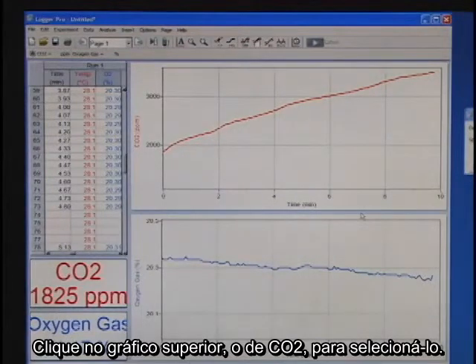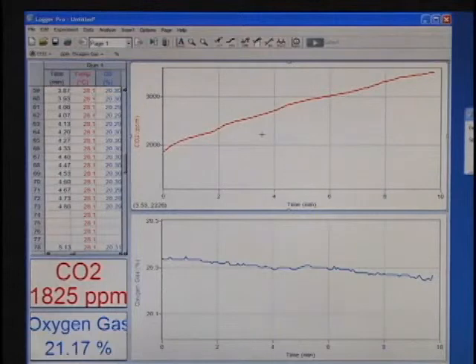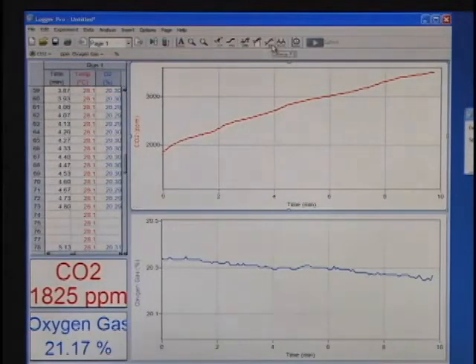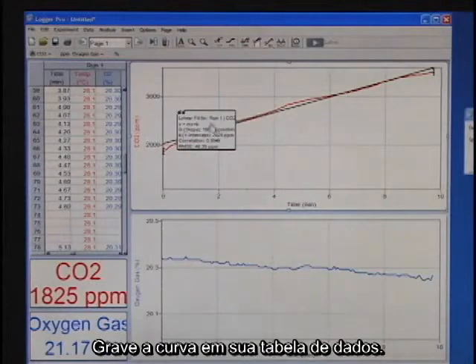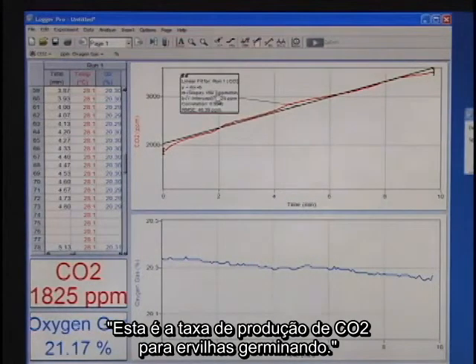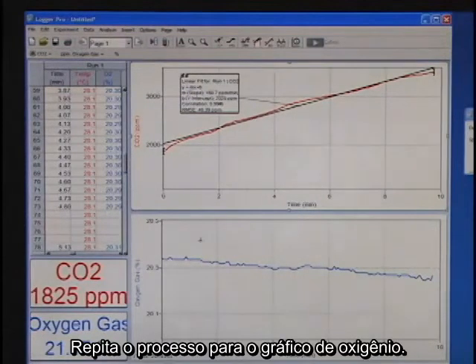Click on the top graph, the CO2 graph, to select it. Click on Linear Fit on the toolbar and record the slope in your data table. This is the rate of CO2 production for the germinating peas. Similarly, repeat this process for the oxygen gas graph.